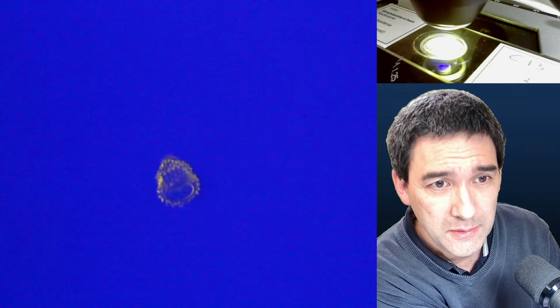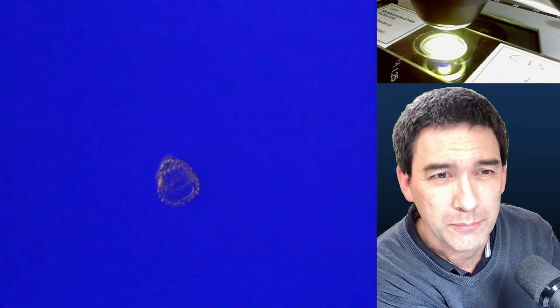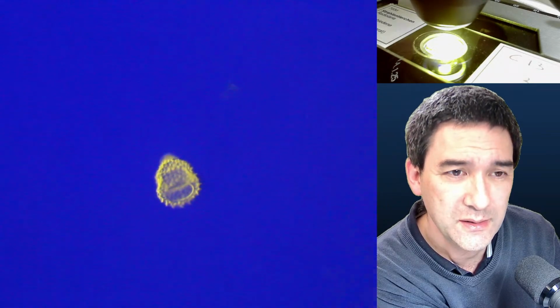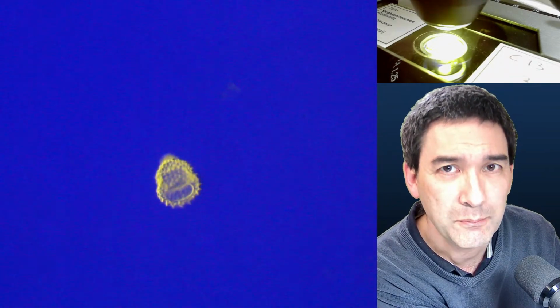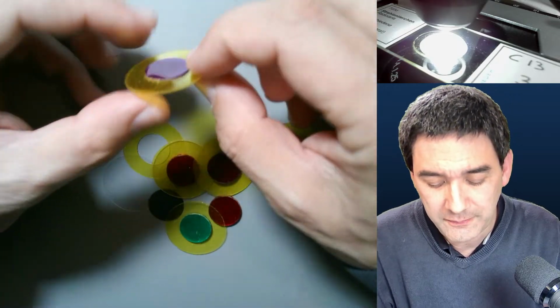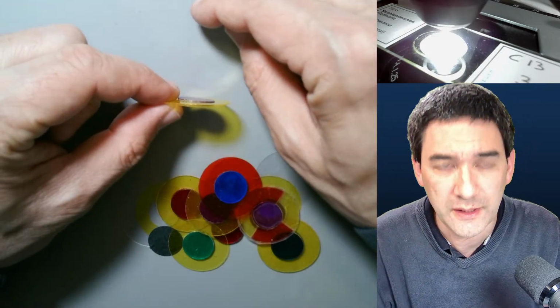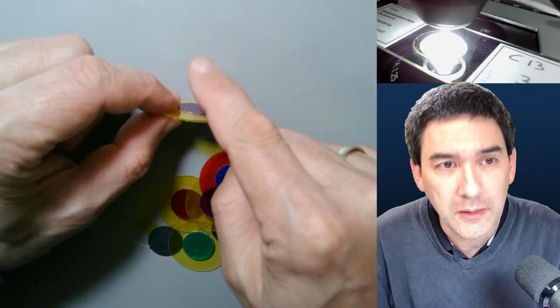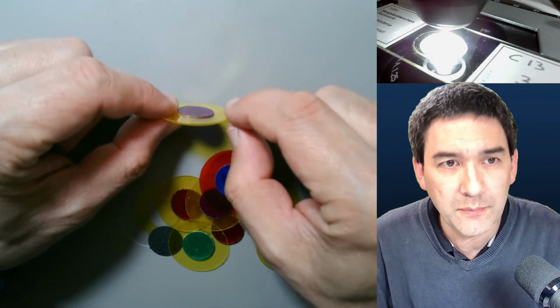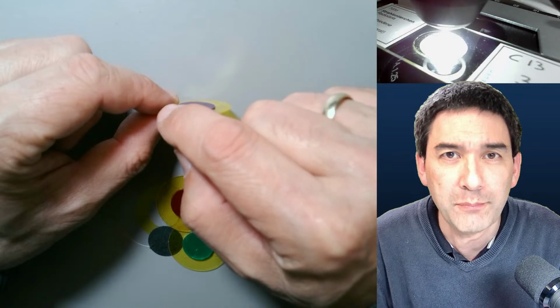And maybe this also kind of works. But I think you do need a condenser, because it's really important that the specimen receives the light from the side. So the idea is again like the following: if you look at it from the side, maybe if I have a specimen over here, then the main light that goes through here will become blue. But the light that comes from the side will not be able to reach the objective directly. It kind of bypasses the objective.